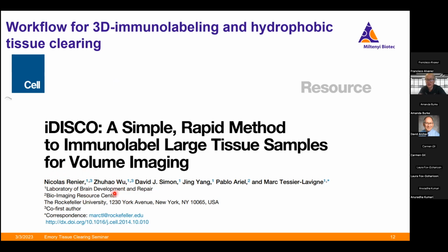I have a question real quick from a user, from Martin. He says that DCM melts plastics. What do you use for that instead of DCM? What do you use as a container? I will get to that. I have a slide on all of that. And I will provide these slides to you as well, April, to distribute. Thank you.